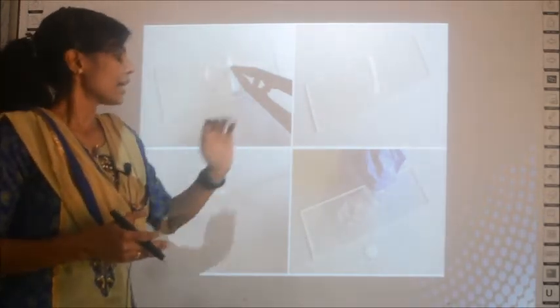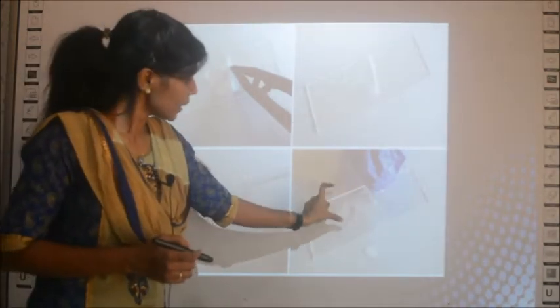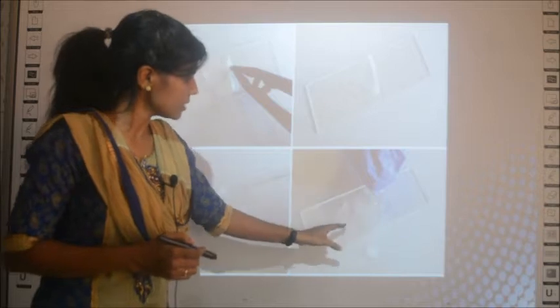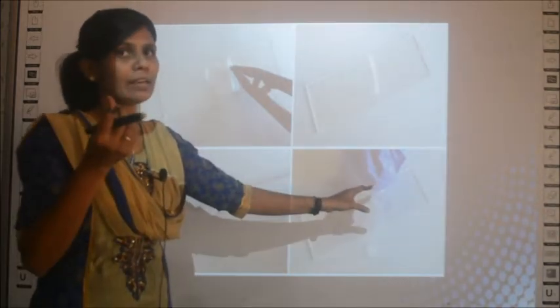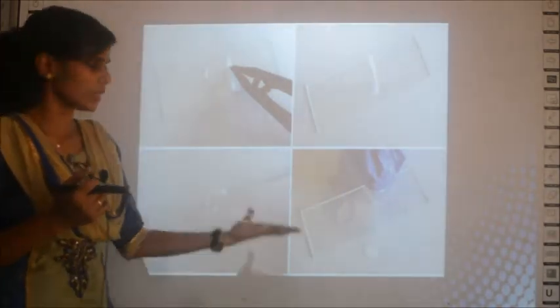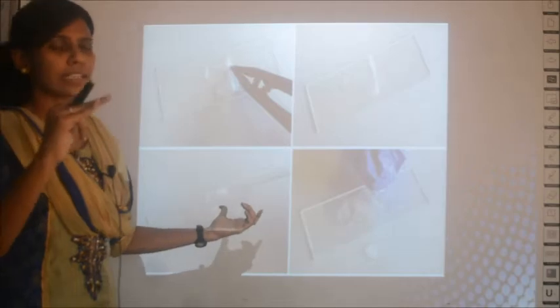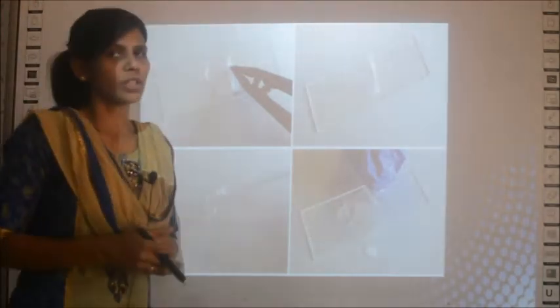So cover it with glycerin, and then can you see, I don't know how clear it is, there is one small slide kept on that. This is actually the cover slip. It is a very thin slide and it is called the cover slip. In this they have not shown the stain, but actually you have to add stain, then glycerin, and only then put the cover slip.